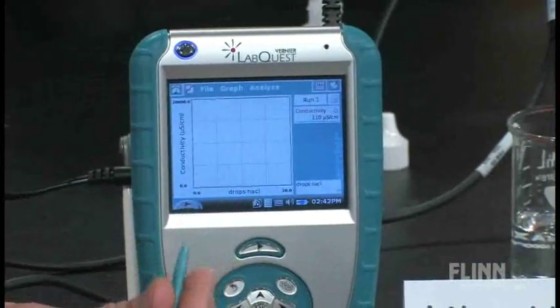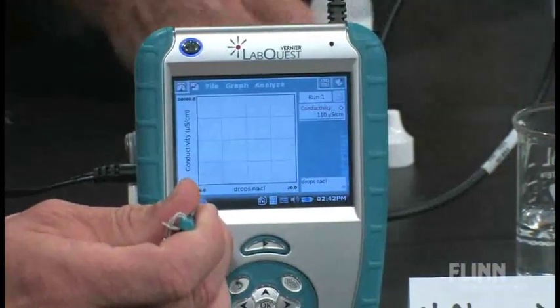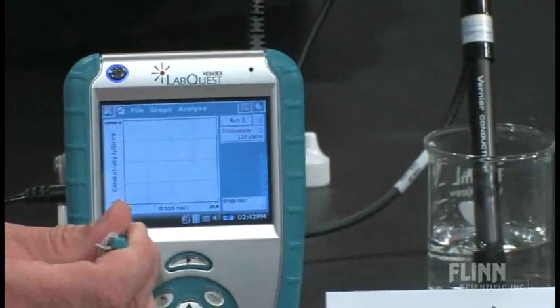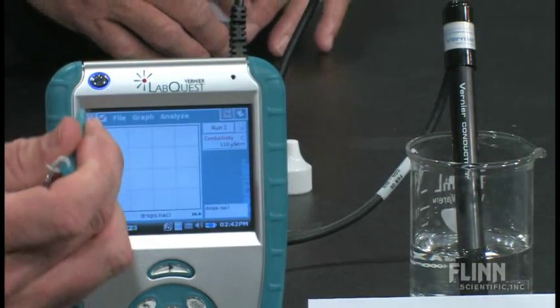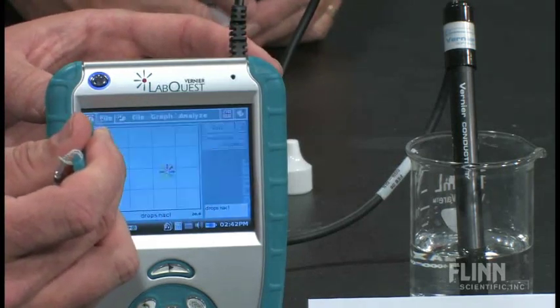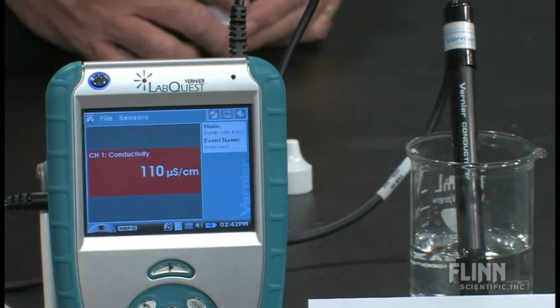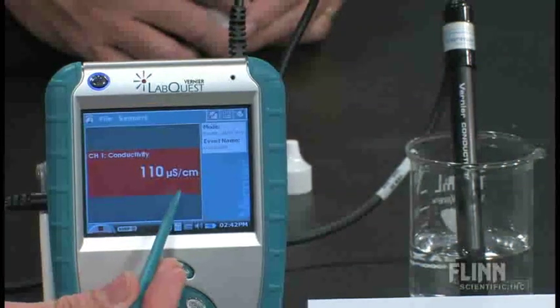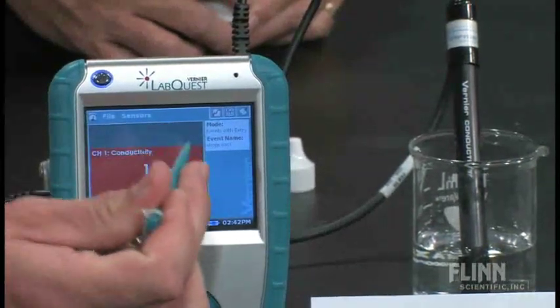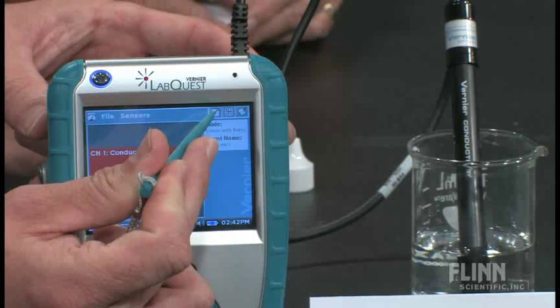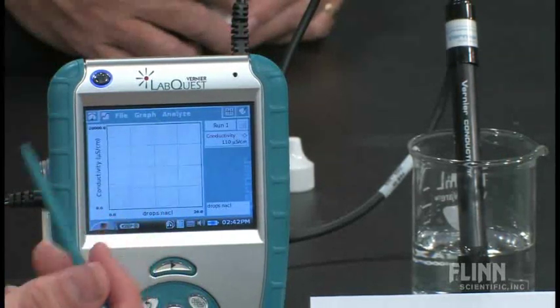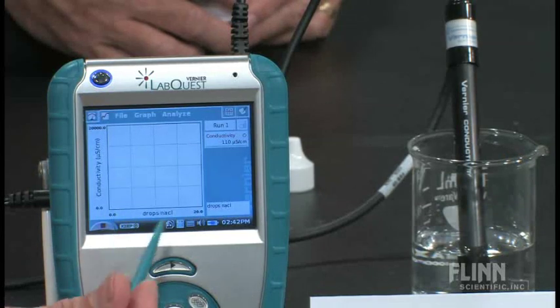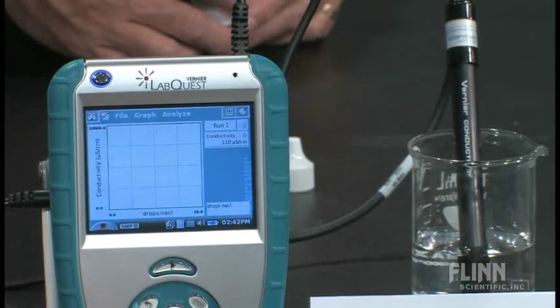At this point in time, we're going to get a baseline conductivity on our distilled water. So we'll start that. I want to look at my meter to see where we're at. We're measuring at about 110 microsiemens per centimeter at this point in time. And that's what's nice about this. It's very user friendly that you can go back and forth between the screens relatively easily.